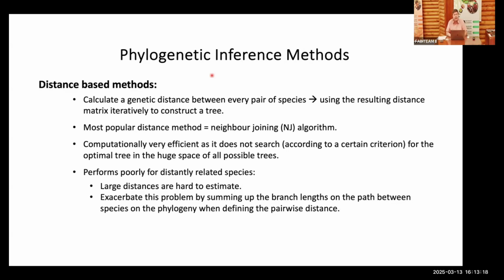It's very quick, so typically we would use it to get a good quick understanding of our phylogeny. So if you want to make sure that there's no problems with your sequence alignment, this is a very quick method to use just to check if you do not have sequences that just cluster somewhere or group somewhere where you do not expect them to be. For example, if you have two genera, suddenly there's a sequence from a genus that groups into a different genus, and obviously there might be a problem with your sequence alignment or the sequence that you used.